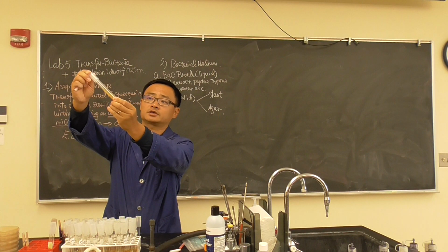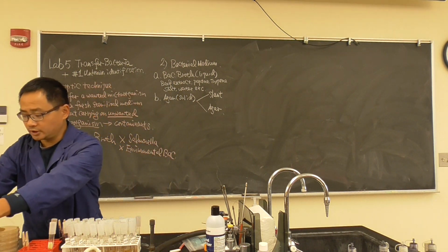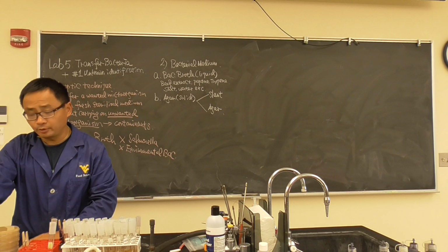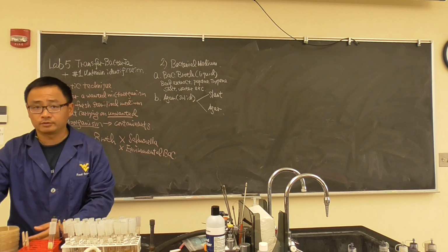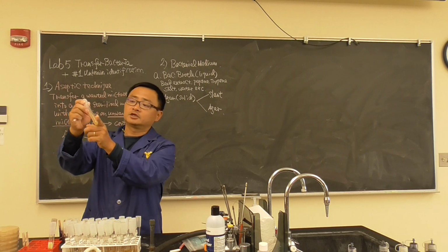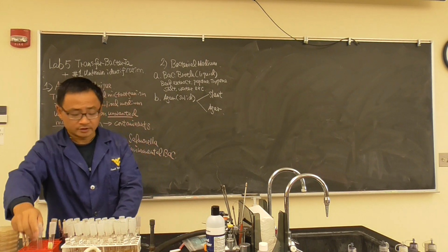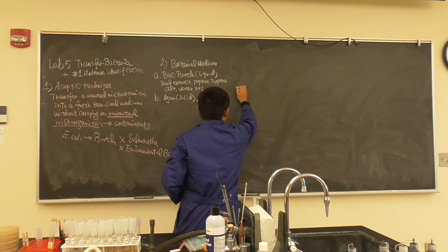Same thing, it is a melted agar you solidified. How do you solidify? Put a little bit of an angle there. Usually an old book, you put it there, you lay it down, it will be solidified. Have this slant showing up. Okay? This is a slant. So slant, very simple to say, looks like this.